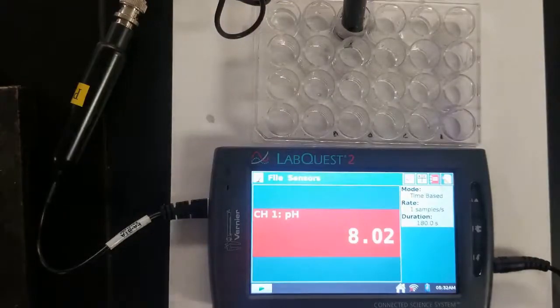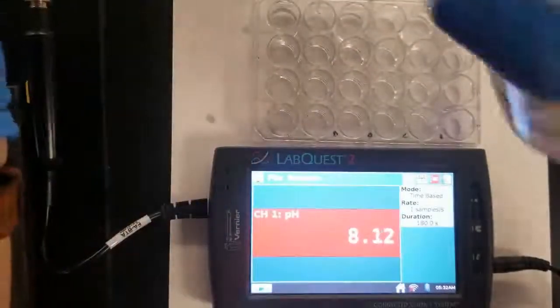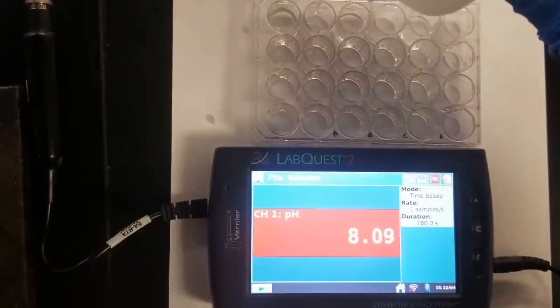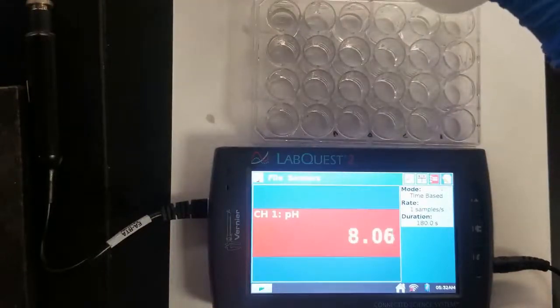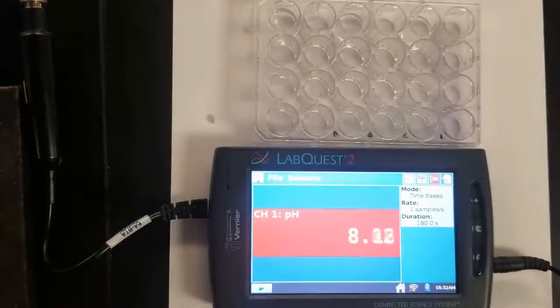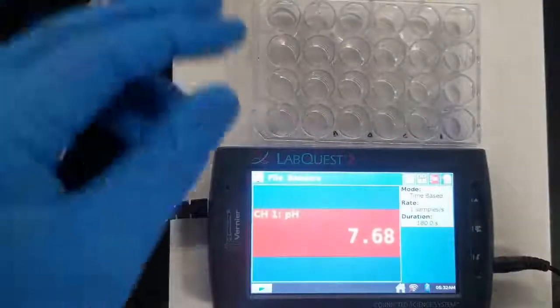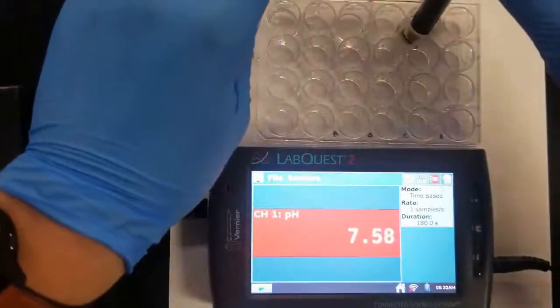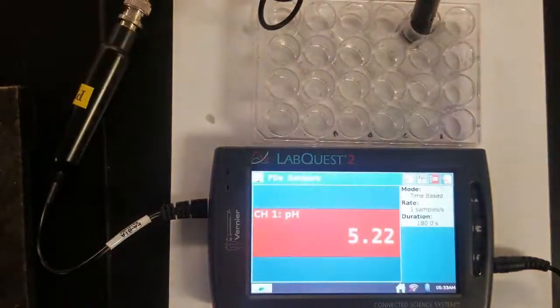Remember, we guessed around a pH of 5 from our indicators. So wash it off. Put it in our unknown.